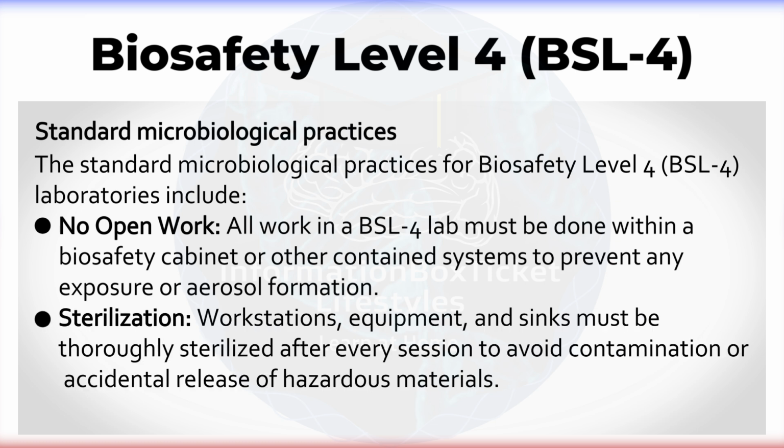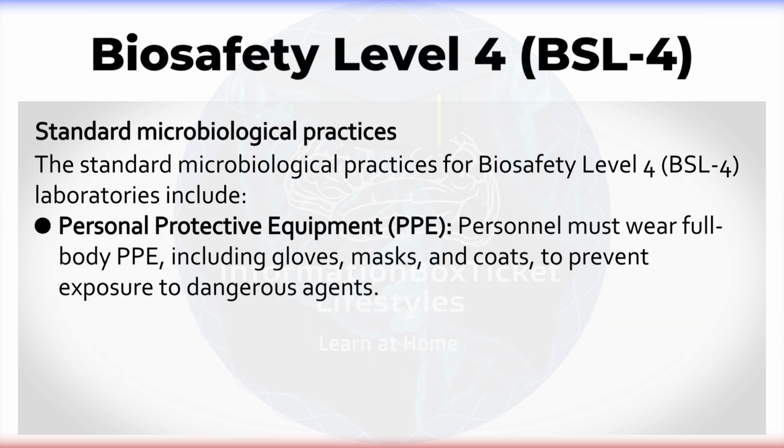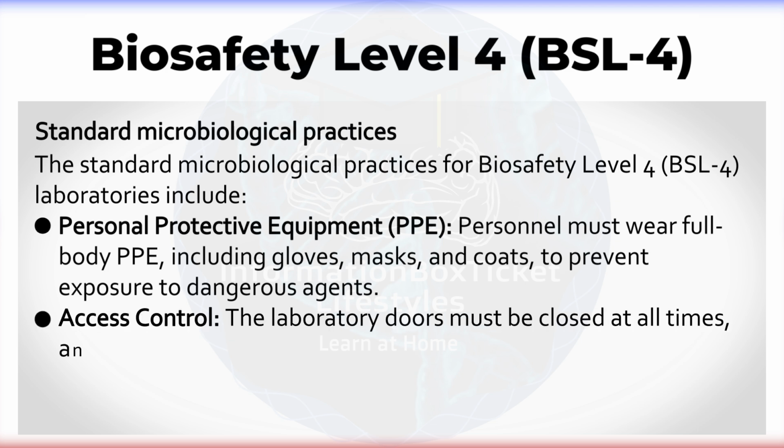Workstations, equipment, and sinks must be thoroughly sterilized after every session to avoid contamination or accidental release of hazardous materials. Personal protective equipment. Personnel must wear full-body PPE, including gloves, masks, and coats, to prevent exposure to dangerous agents.